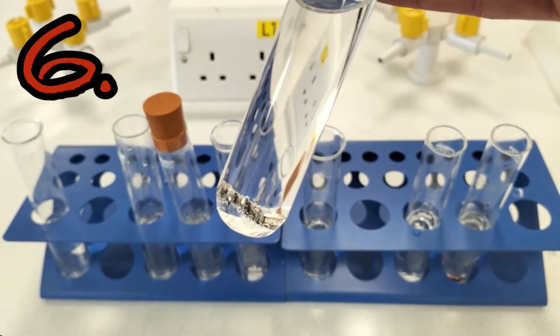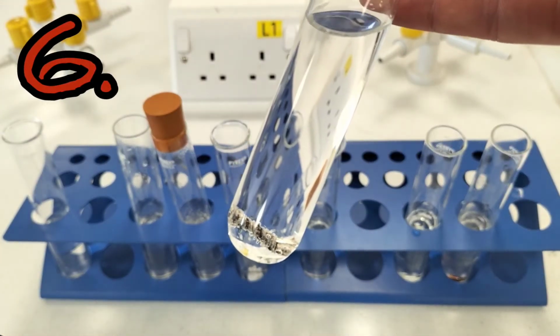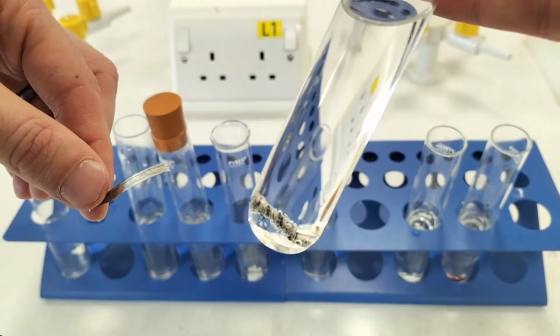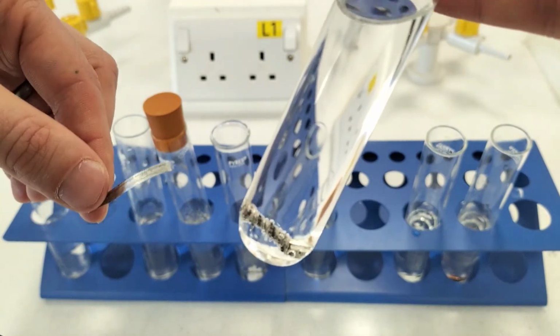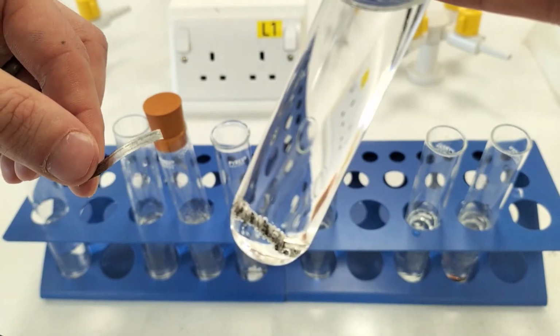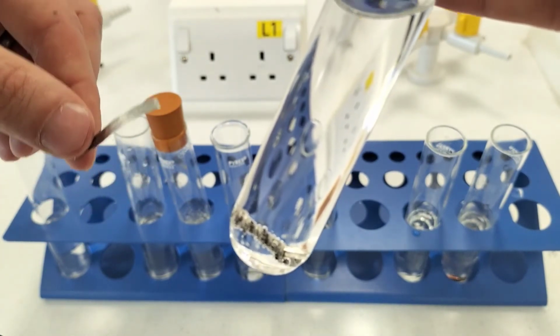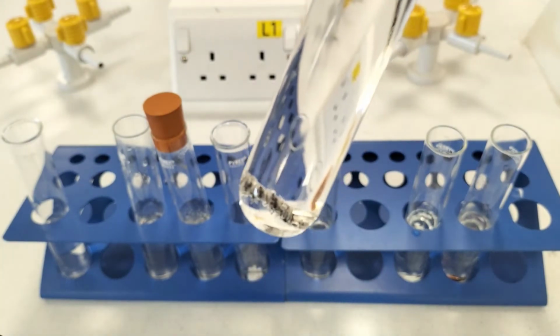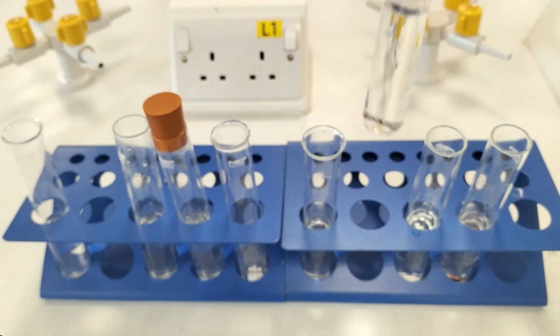Now in experiment 6, I have wrapped a piece of this metal, magnesium, around the iron nail. So this iron nail is constantly in contact with this piece of magnesium metal. We're going to see what effect that has on the rate of rusting of the iron nail beneath the magnesium.